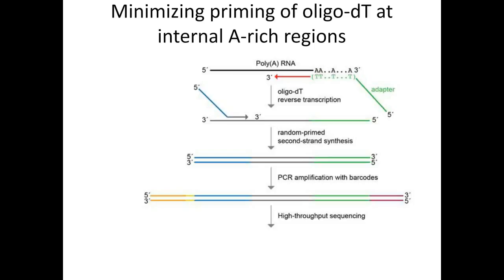Before mapping these reads to the genome, we clipped off the adapters that are sometimes present at the 5' end. If you look at the slide here, the portion of the DNA in blue is the adapter. Occasionally the insert size is less than the read length. So if the insert size, let's say, is 40 and the read length is 50, we're going to read 10 base pairs into the blue, and we want to clip that off. So we did that. At the other end, we did not need to do any clipping, mainly because the oligo-dT was efficiently hybridizing to the junction between the poly-A tail and the genomically encoded RNA. So we didn't have to do anything there.